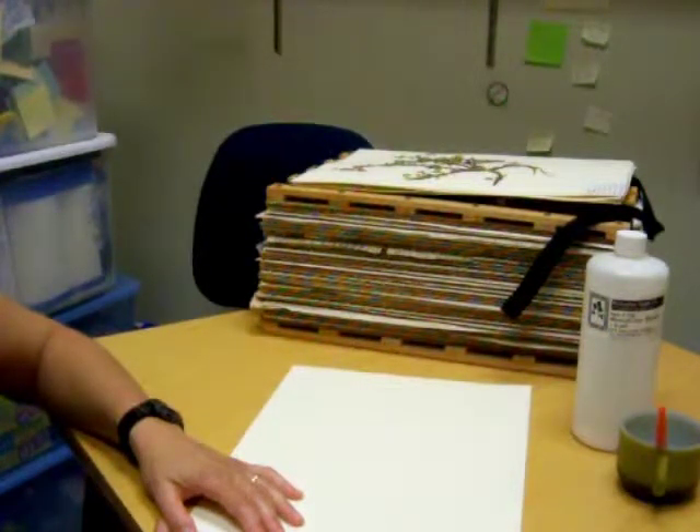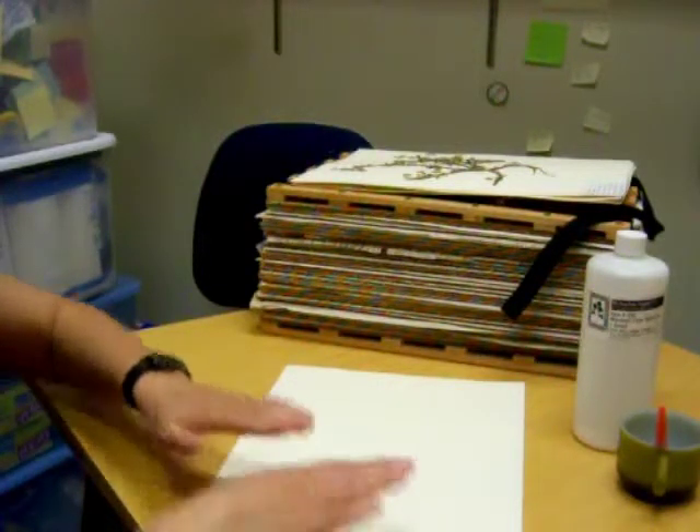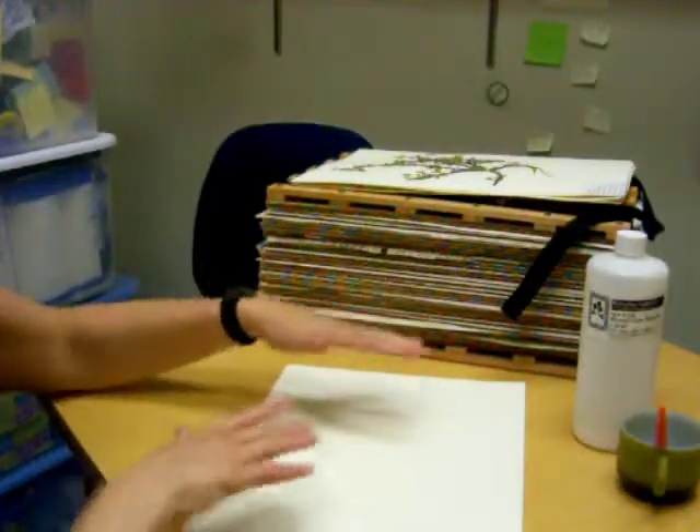Is it a wetland? Is it a forest? Is it an edge habitat? That's what goes under remarks. Then take a sheet of wax paper — we have wax paper in the lab — put that over this, and then you can do your next one and stack them up on top very loosely.